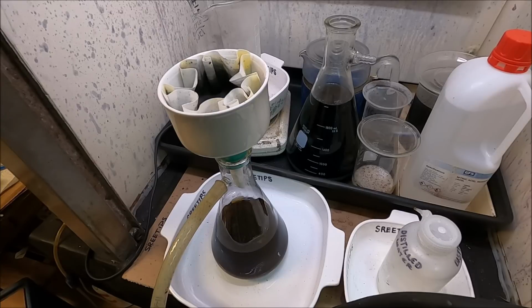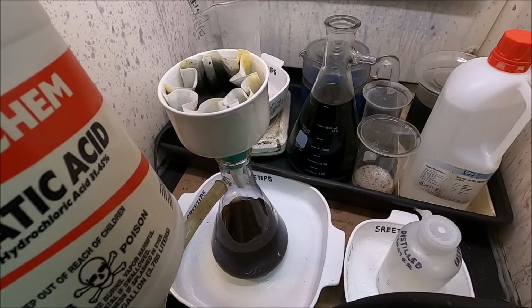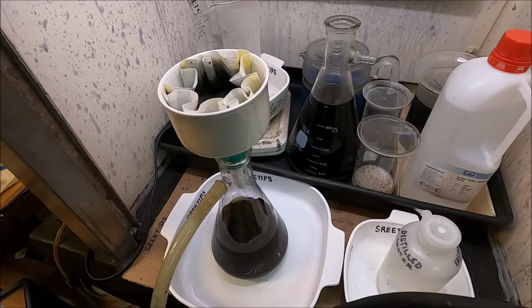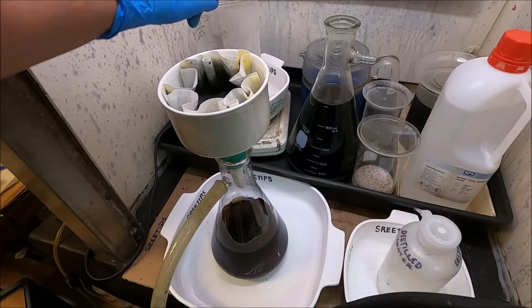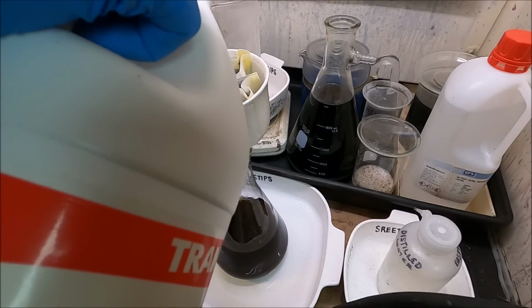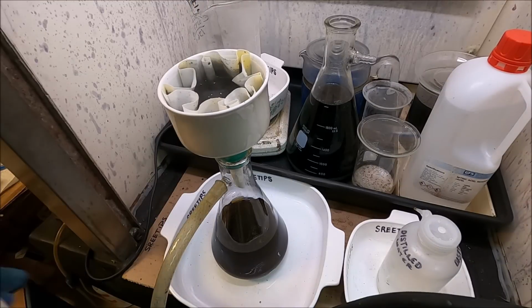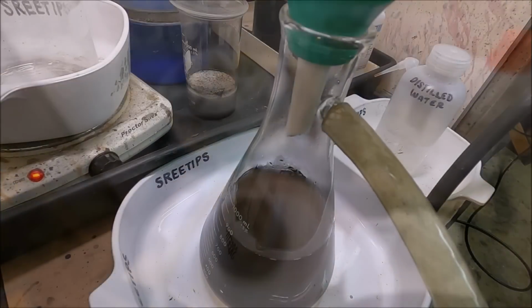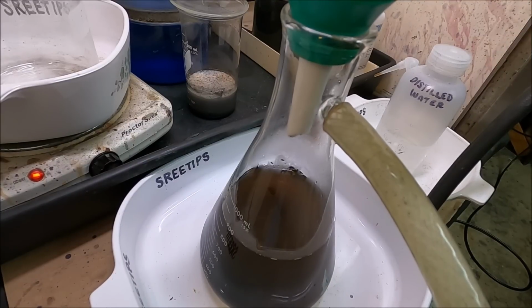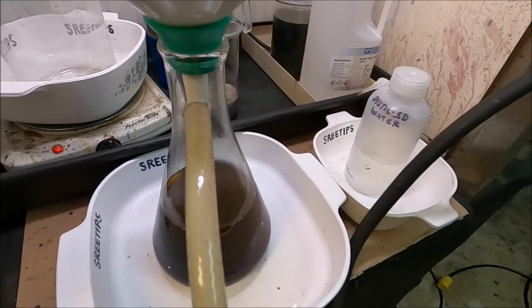We've got all that solution pulled through. I'm going to use some hydrochloric acid here, rinse the solids out. We're going to get them back in this beaker and do another extraction on solids out of this filter here. Alright, we got that solution running clear through the filter. Got pretty much all of it pulled through now.